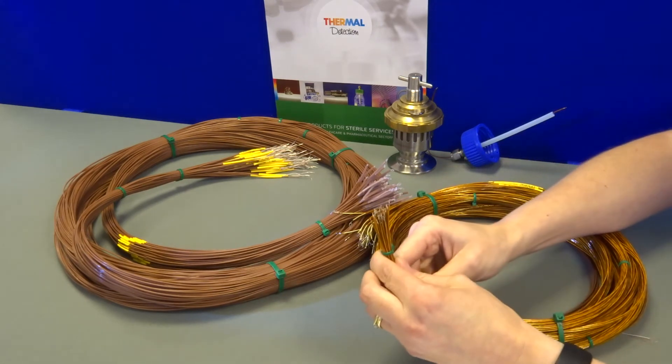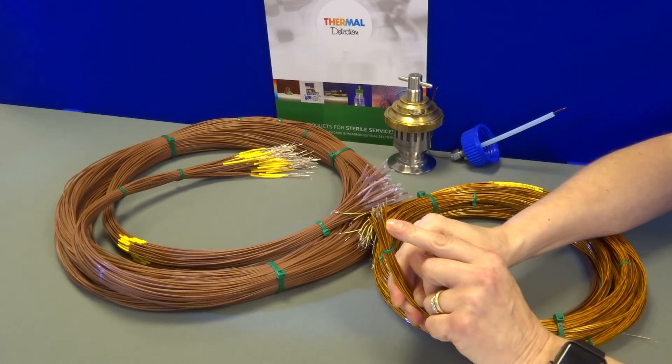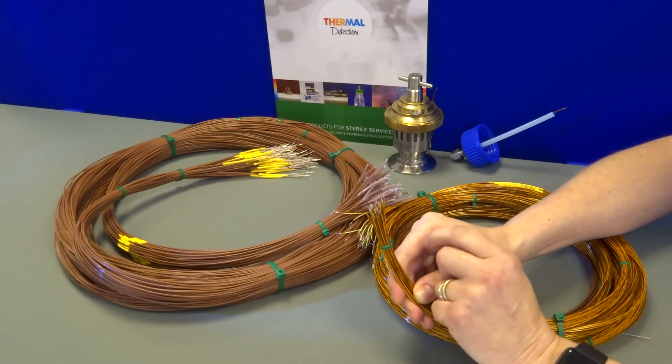The hot junction is formed by TIG welding and purging an argon envelope whilst welding a good, clean weld. This would reduce the rate of oxidisation at the hot junction.